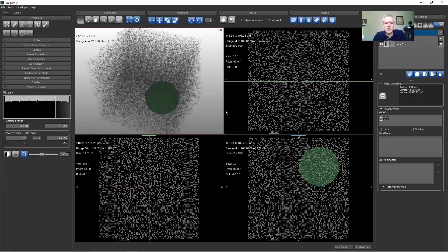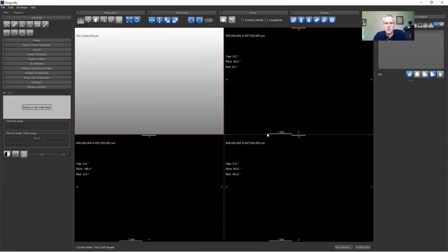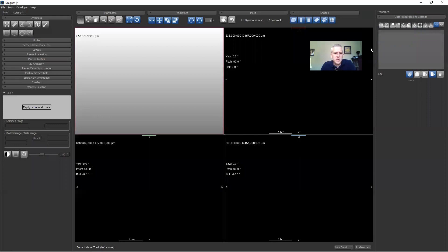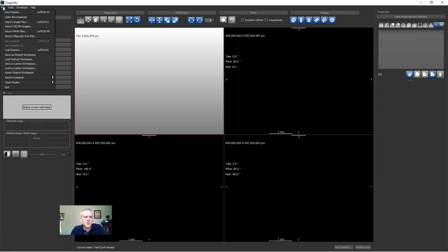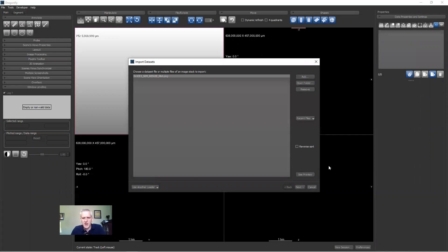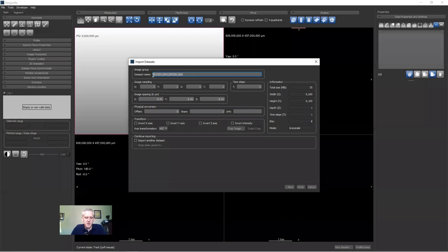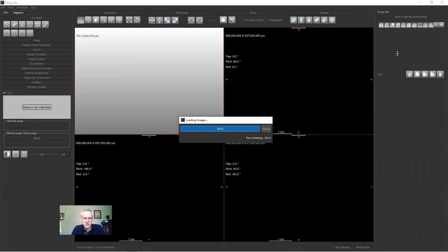I'm going to go over to Dragonfly and click the New Session button to clear out what I was working on during Q&A. New Session gives us a fresh start. I'm going to import both data sets, starting with the SEM: Import Image Files, Add, and here in my Downloads I have the SEM image. I'm pretty sure the horizontal field of view is 2.5 millimeters, which works out to 0.41 microns or 410 nanometers per pixel. I'll key in 0.41 for all axes, rename it 'North Sea Sandstone SEM,' and click Finish. This is 6,100 by 6,100 pixels — just a 2D image.